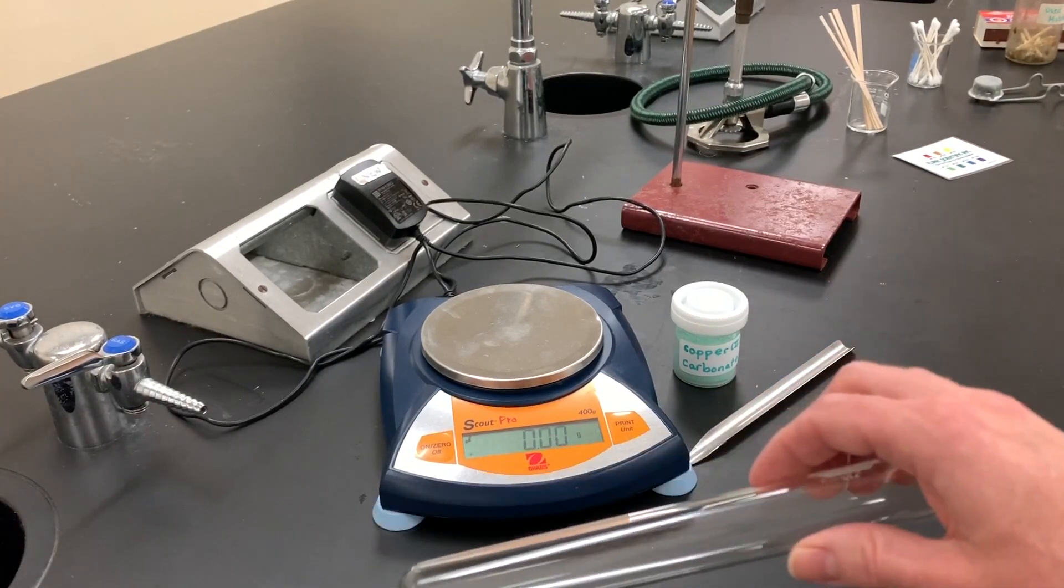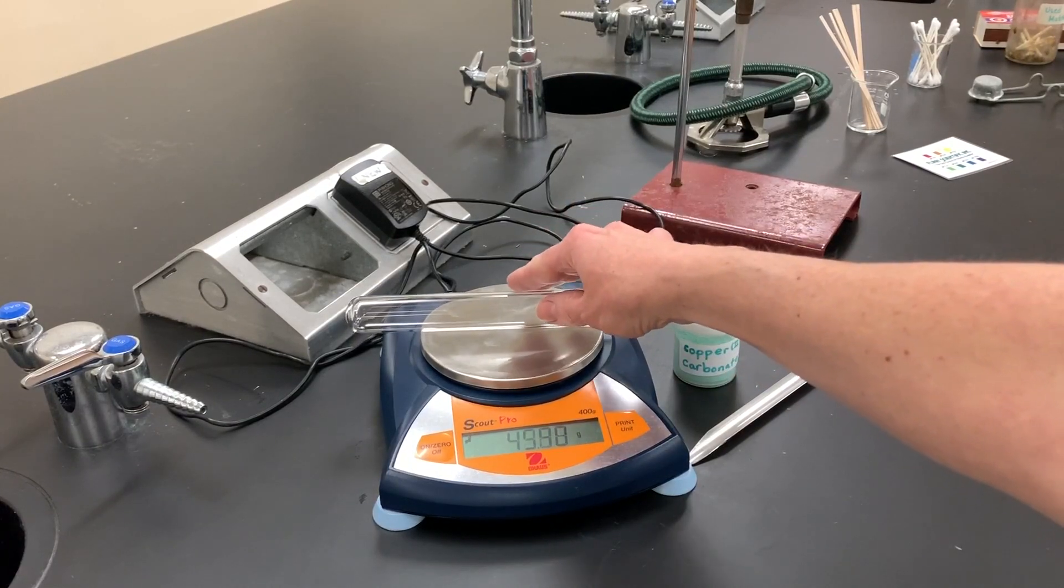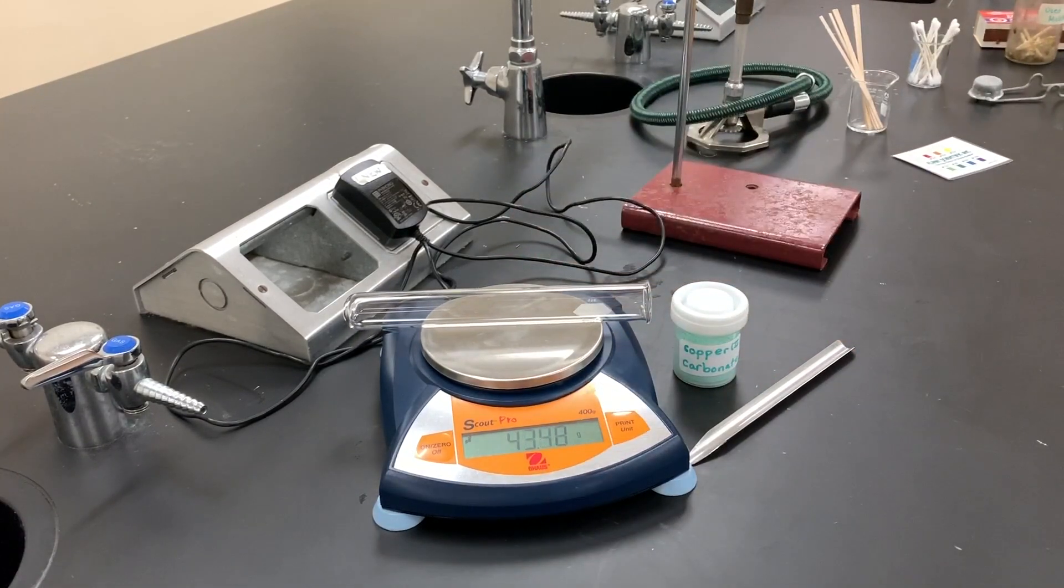Place the test tube gently on the balance so it doesn't roll off. Make sure it's stable, then record that original mass. In this case it looks like 43.45 grams in your data table.